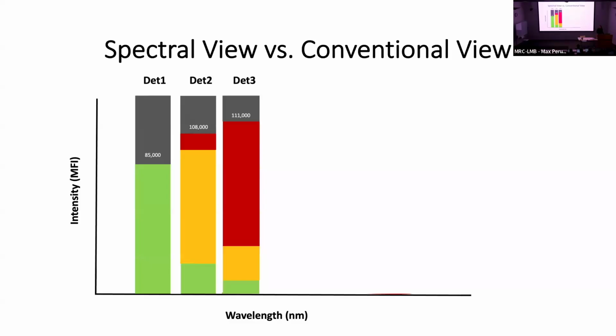We want to ensure that each of these contributions of spectral spill are removed from that initial readout. Because if you don't remove those, you're potentially facing some false positives that don't truly exist. They're not really real, but they're positives based on spectral spill or emission spill into those other detectors.